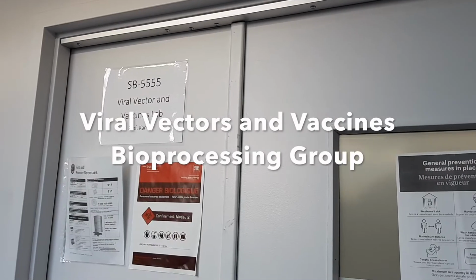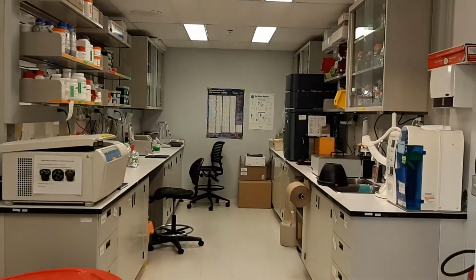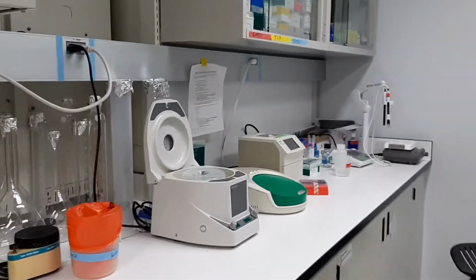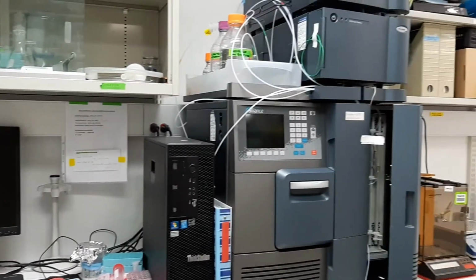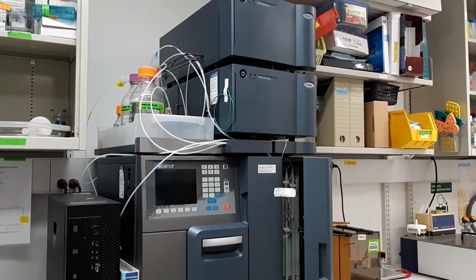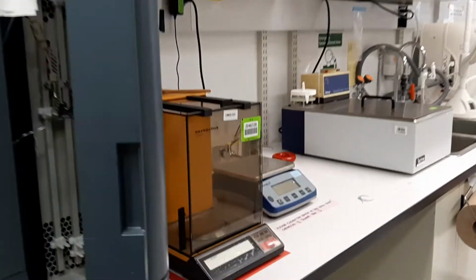The Viral Vectors and Vaccines Bioprocessing Group, led by Professor Amin Kamen, is part of the Department of Bioengineering at McGill University. Our group is examining how the viral vaccine production process can be accelerated by understanding how cells and viruses interact, as well as the cellular metabolic state needed for maximum productivity. This understanding will help develop the processes and technologies needed to make safe, potent, cost-effective vaccines.